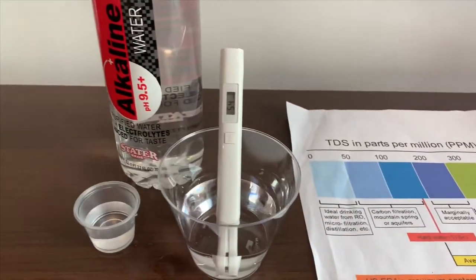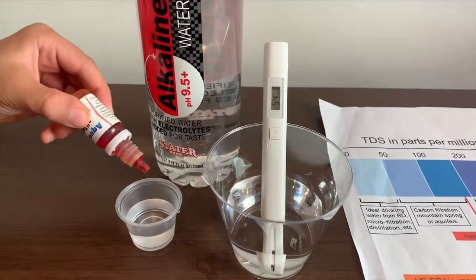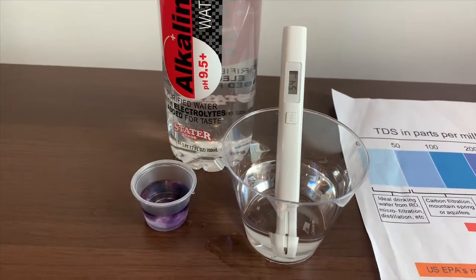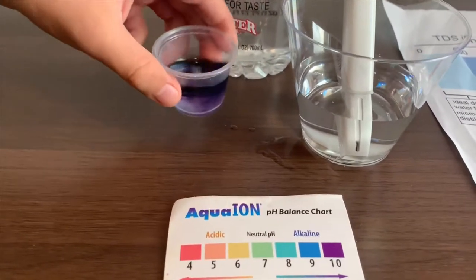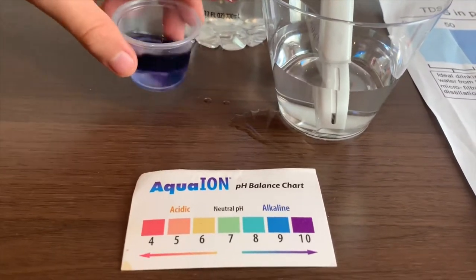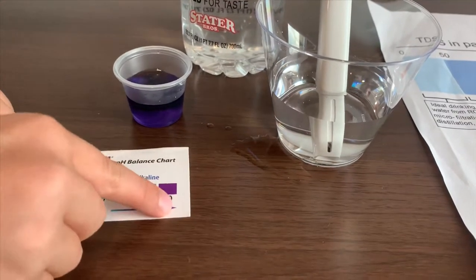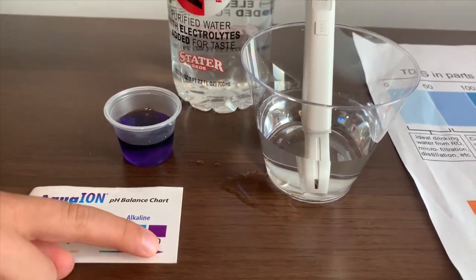Now let's test the pH level. Only do two drops. I see this is teal — that is alkaline water.